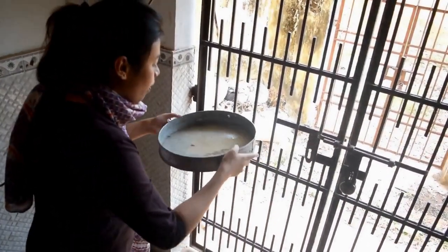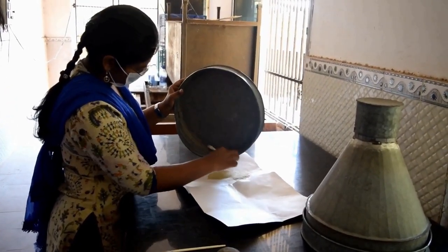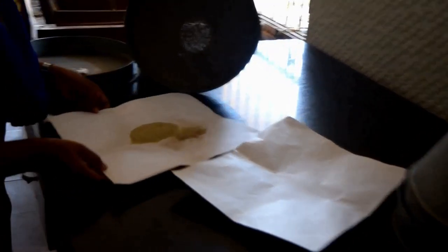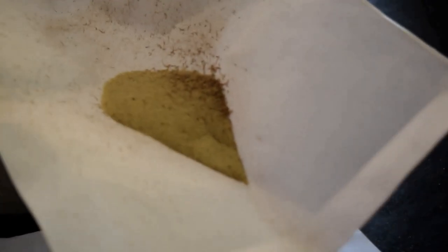Scales are eliminated by blowing air by mouth along the direction of wind in an open place. Other broken body parts are discarded by sieving through a tea strainer and winnowing on a piece of art paper.